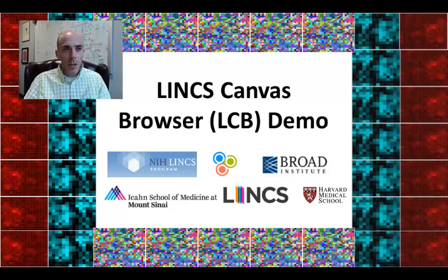For the Library of Integrated Network-based Cellular Signatures, LINCS, many gene expression signatures using the L1000 technology have been produced. The L1000 technology is a cost-effective method to measure gene expression at large scale. The LINCS Canvas Browser, which I'm going to demo today, is an interactive HTML5 web-based software application that facilitates querying, browsing, and interrogating almost all the currently available LINCS L1000 data.